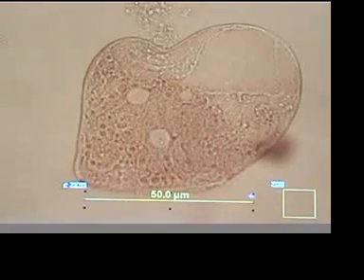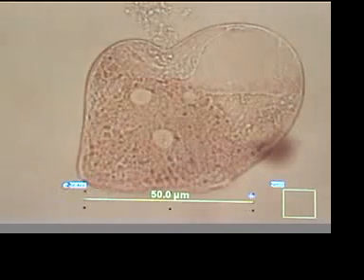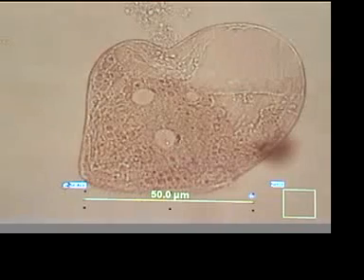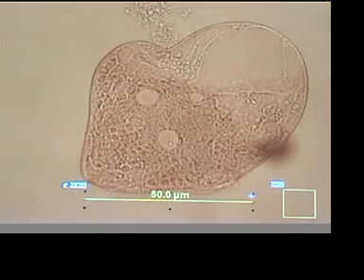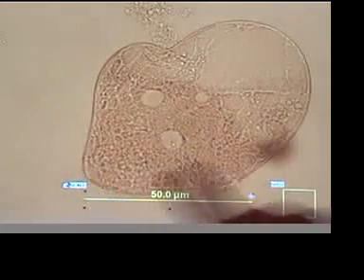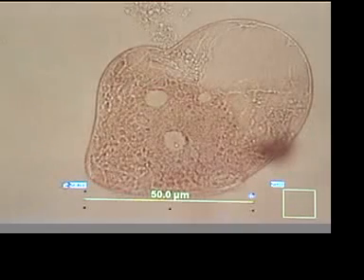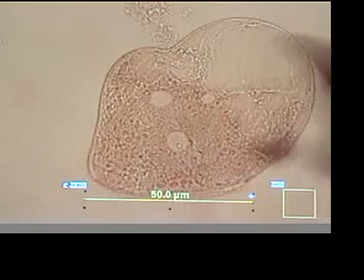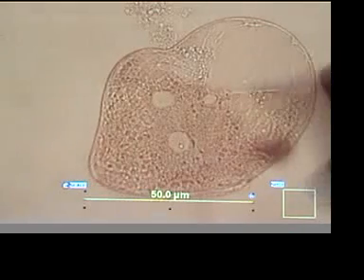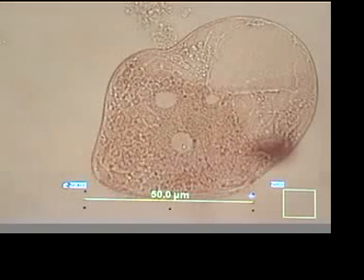And now we're seeing a shape change here, a little distension. Here's a good focus. And now you begin to see quite a few of these spheroid shapes that will happen. And here's a huge, what used to be a very clear circular vacuole, now it's just a giant open rectangular space.